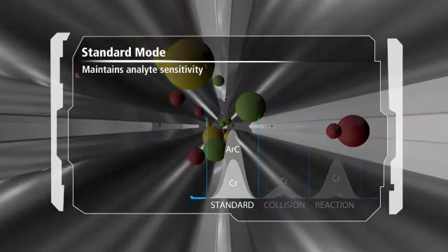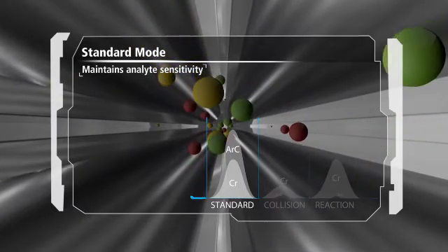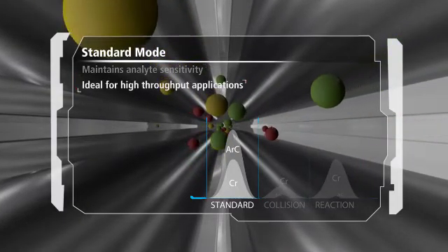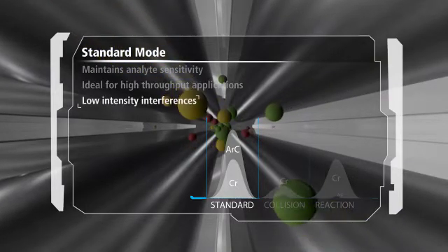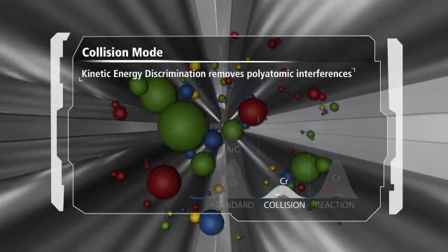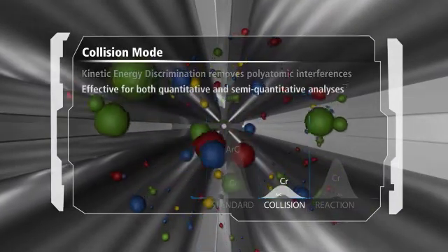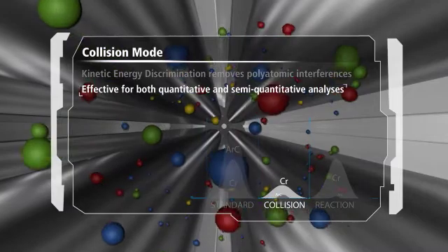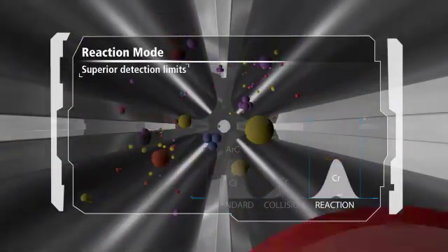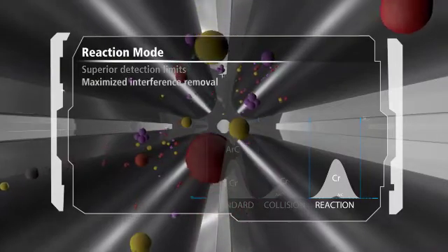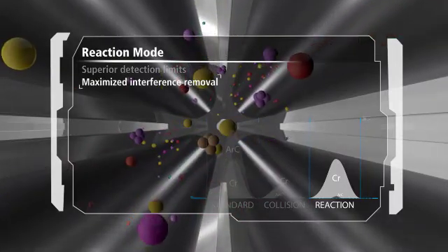For simple matrices and samples with minimal interferences, select standard mode. Here, the cell gas is turned off and the system operates like a non-cell instrument for normal sensitivity. Easily switch the instrument to collision mode to remove polyatomic and unknown interferences. For applications that require superior interference reduction and uncompromising performance, Nexion 2000's reaction mode truly delivers.